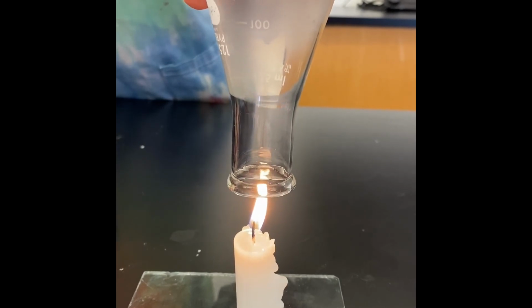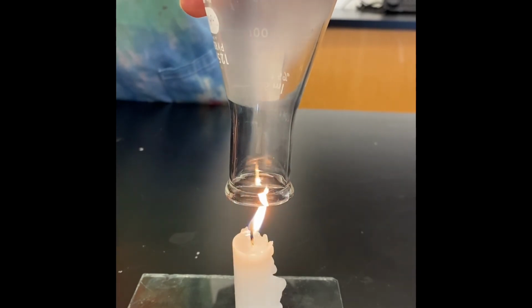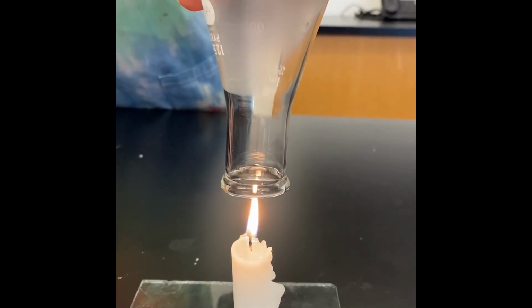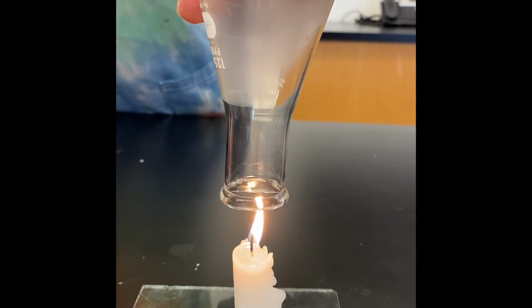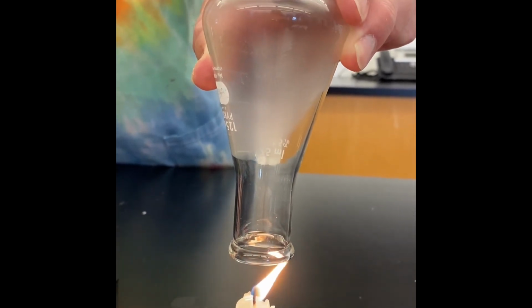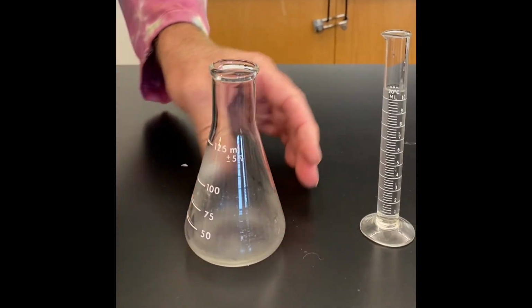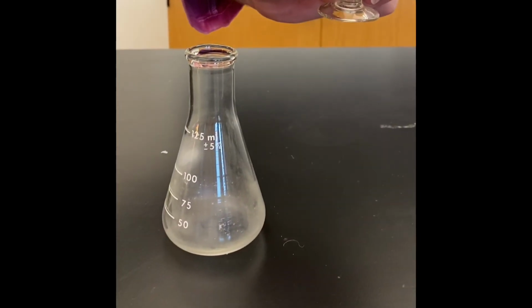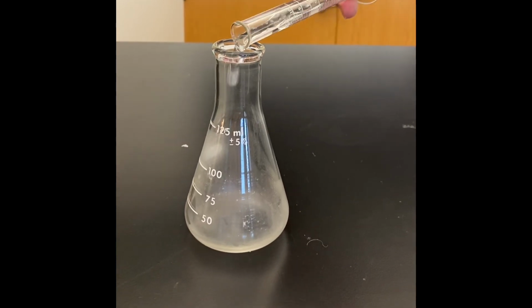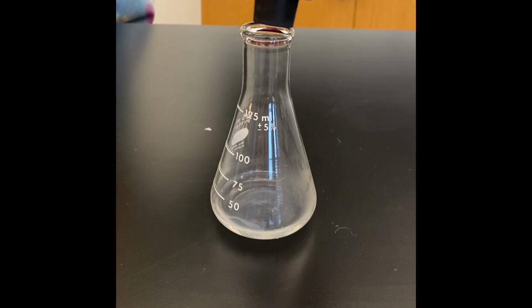And what I'm going to do here in about say 10 to 15 seconds is turn this flask over. I'm going to pour that clear lime water into the flask. I'm going to stopper it and I'm going to shake it, and I'm going to look for a change in the lime water. So I'll turn this over, set it down. I'm going to add the lime water, and again, notice the lime water is clear. I'm going to put a stopper onto the flask, and I'm going to give it a good shake.